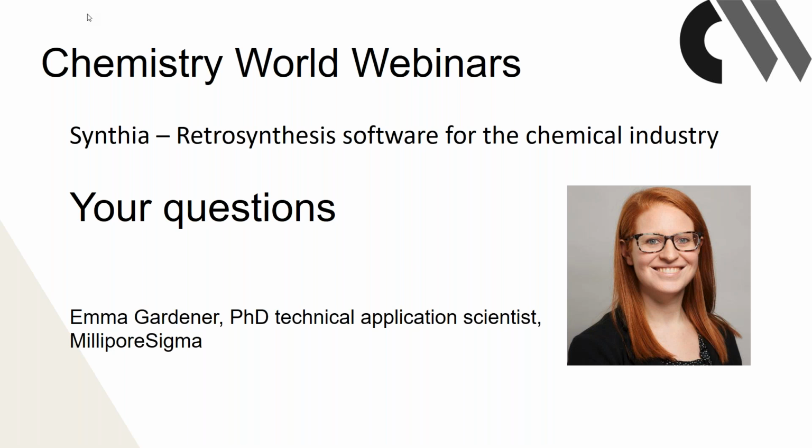We do have a variety of licensing packages that are very customized for users, so we can talk about that. And we also have a lot of other resources on our website as well. So that's a good place to find that.